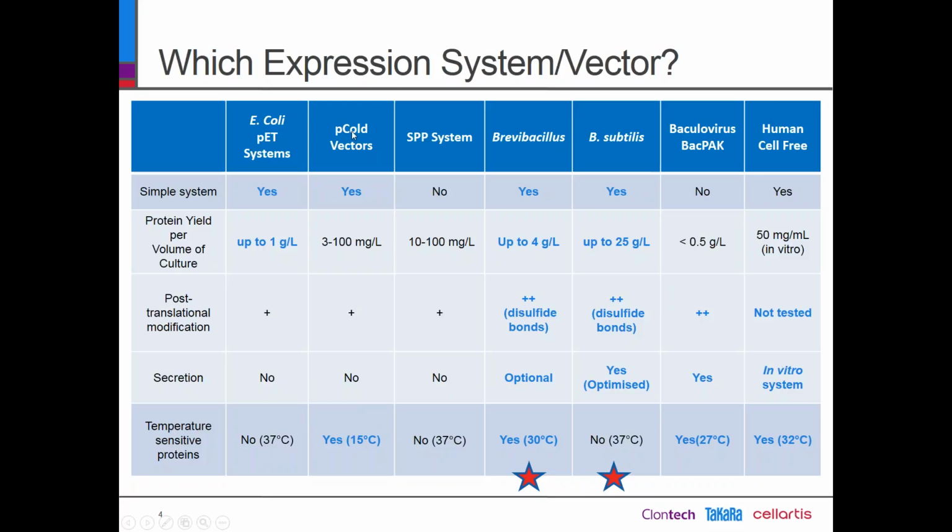They have promoters that are active at very low temperatures, like 15 degrees, so you can still get your protein, but the endogenous proteins from bacteria are regulated down because they have normal promoters. So you will increase the amount of protein you get, protein of interest, compared to endogenous contaminations. And it will also increase, as I said, the stability of the protein because you are working at lower temperatures.